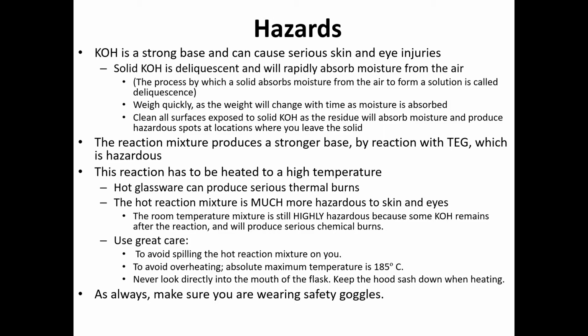So just going over a little bit about the hazards that are in this lab. Again, potassium hydroxide is a strong base, and because of this, it can cause some serious damage to the skin or the eyes.